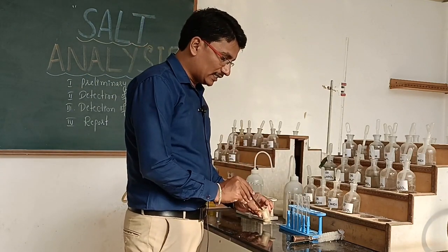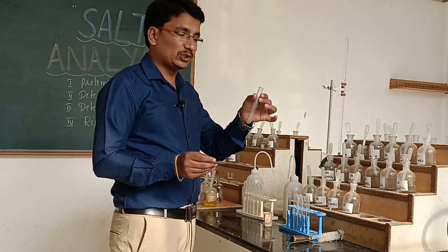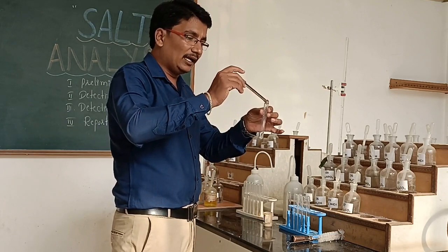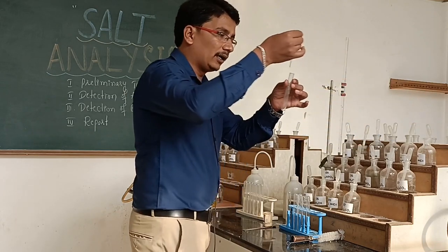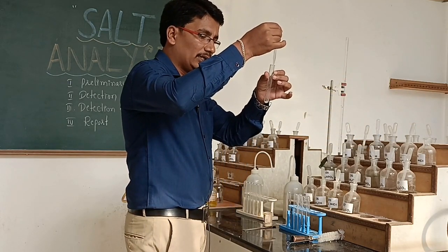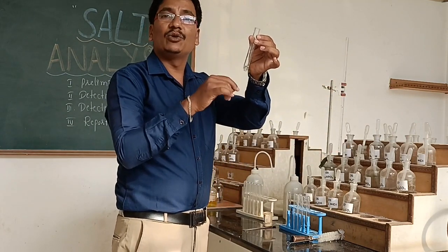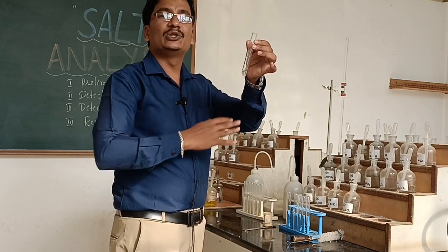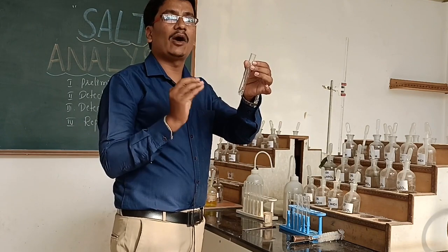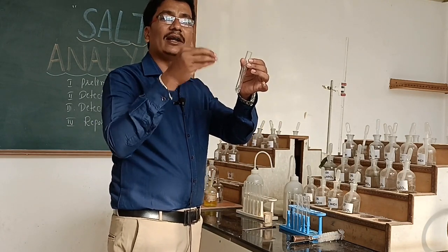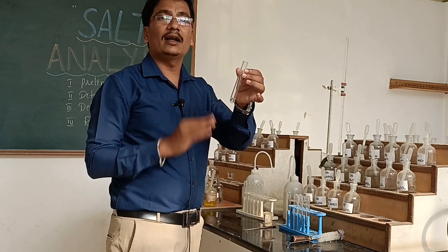We begin with the detection of first group acid radicals. The test is: salt plus dilute HCl or H2SO4. I will add dilute HCl to the test tube. There is no effervescence and no fumes evolved. If there is no brisk effervescence, then the first group acid radicals are absent — that is, carbonate is absent.